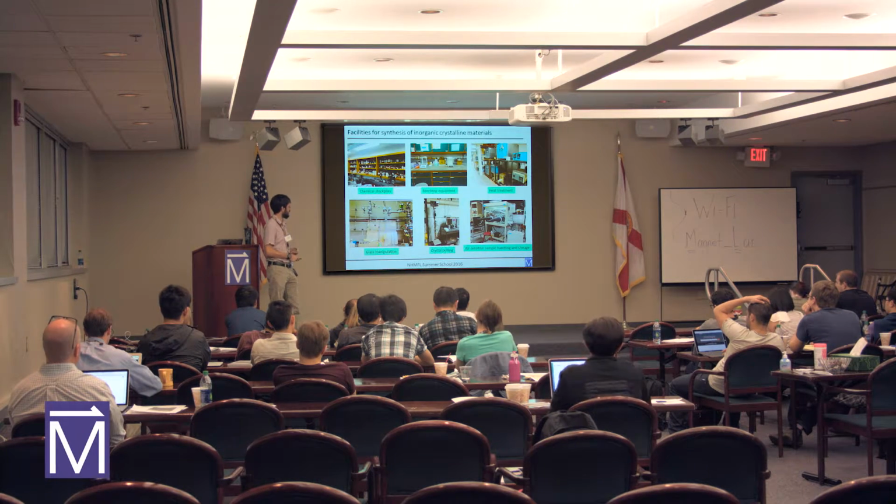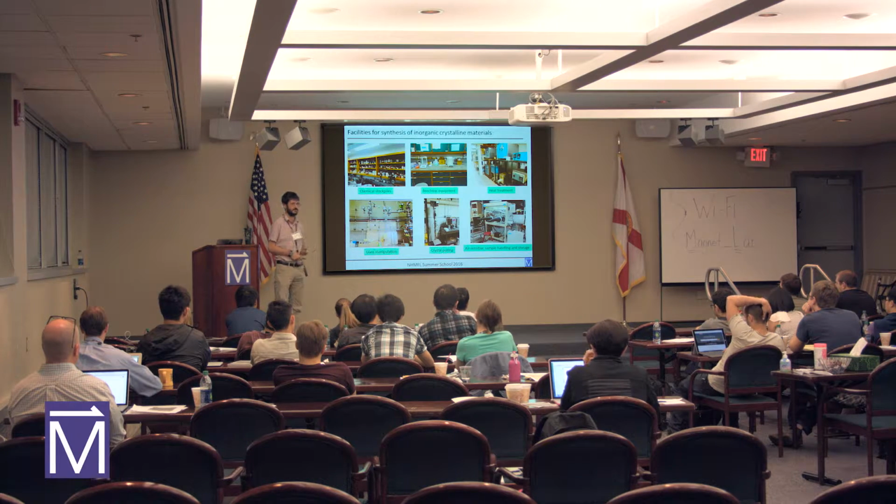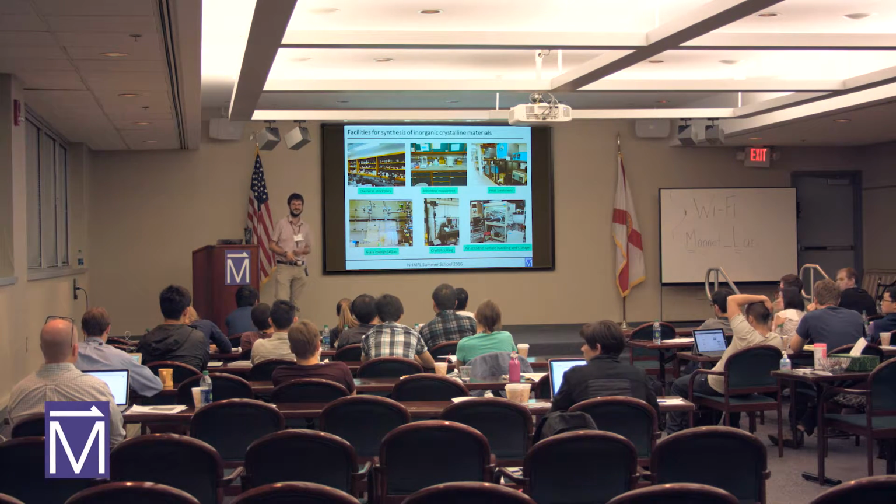And then another really wonderful thing that we have, and a lot of institutions have, are facilities for handling air-sensitive samples and their storage in an argon glove box. I think you've probably all noticed that as you go down to the user cells, there's an argon glove box down there that's available for you to use. I think Tim's in charge of it.